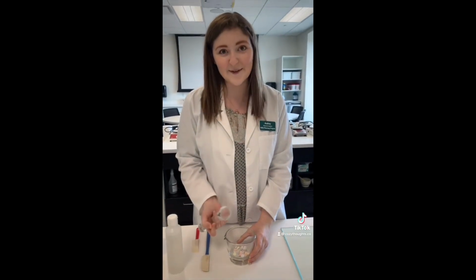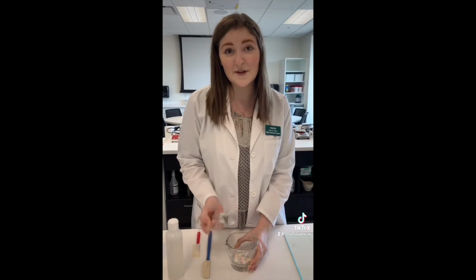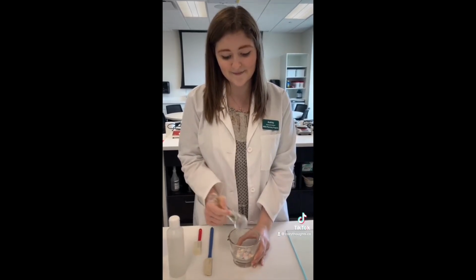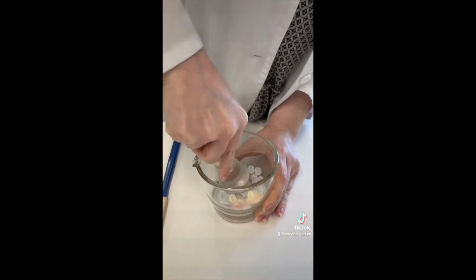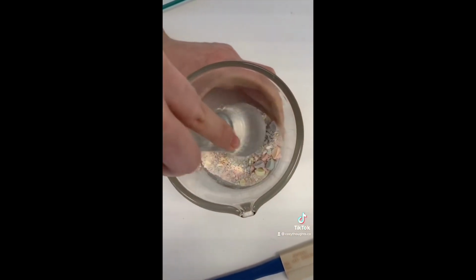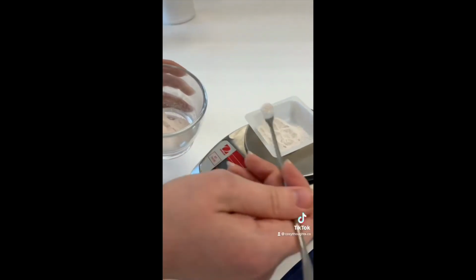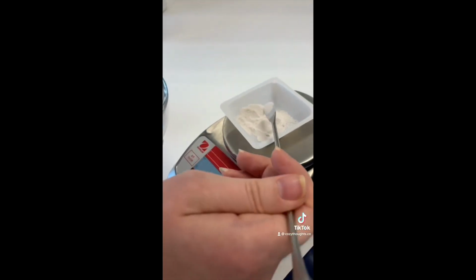Normally these would be pills, but to show this concept, we're using Smarties, and I'm going to be triturating these tablets with a mortar and pestle. Now that the Smarties are in a fine powder, I'm measuring out 5 grams of the powder.